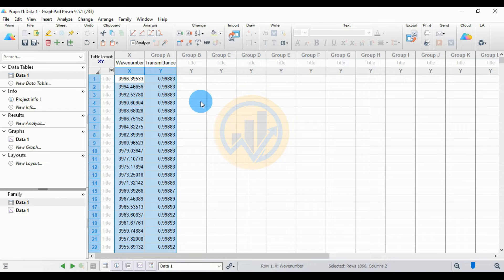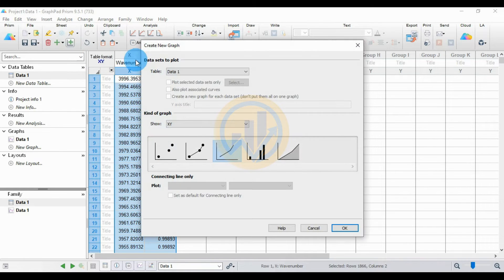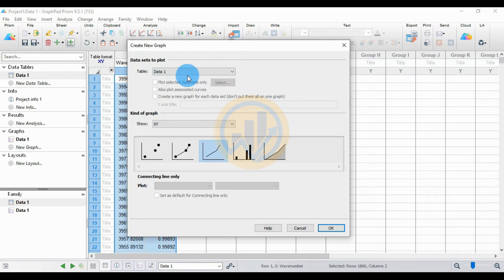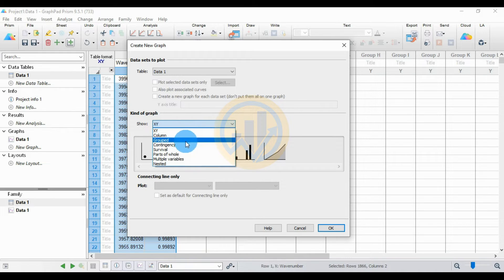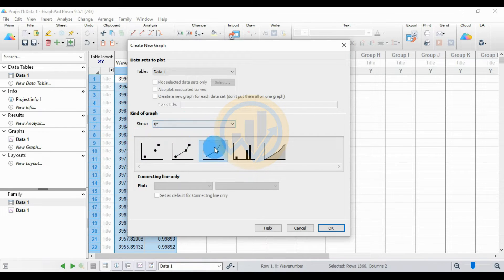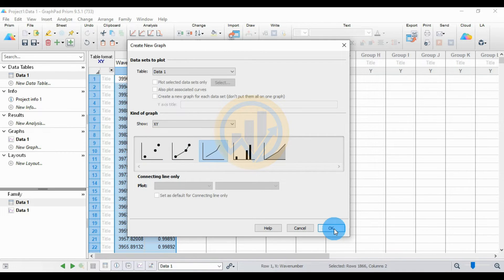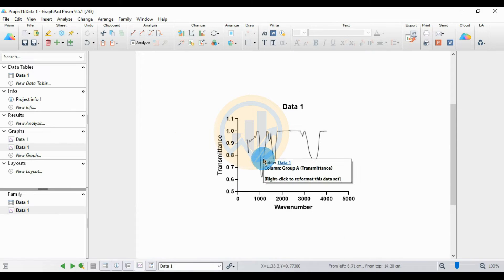Now click the button to create a new graph for the FTIR data. A new tab opens for the new graph. Click the menu options and select the X-Y option. Select the X-Y graph type, choose the line diagram in the middle options, then click OK.